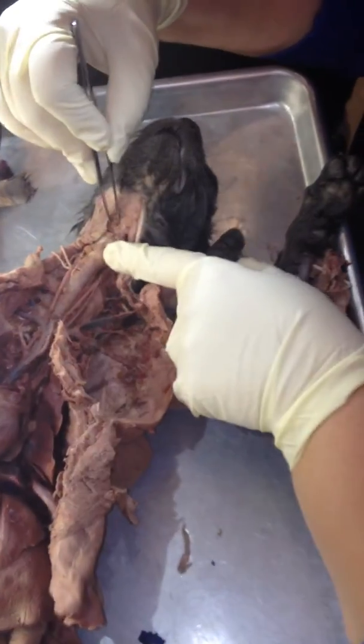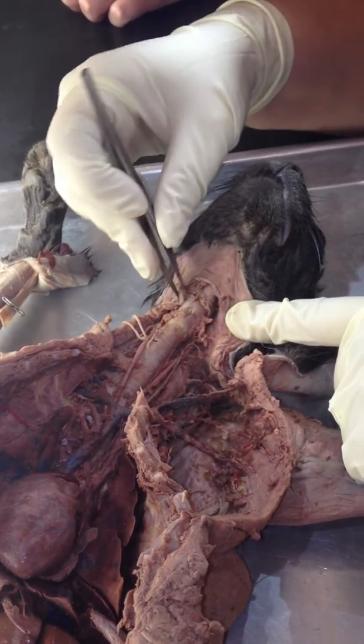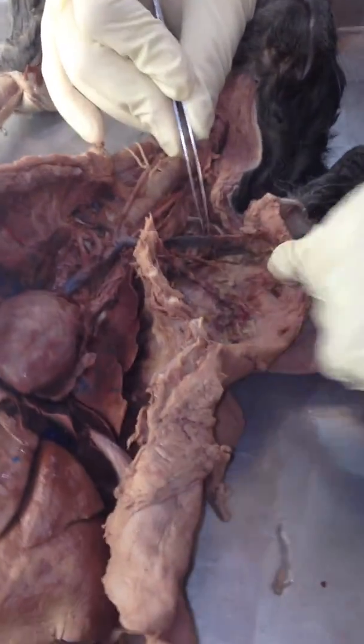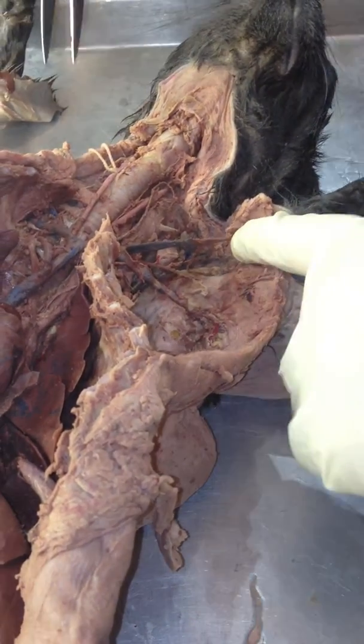Come up here, and sometimes you can see it, sometimes you don't, but if there were one right here, what would it be? Oh, that's the connecting one to the jugulars. Transverse jugular, right. And then this one, transverse scapular, going down to the scapula. Okay.